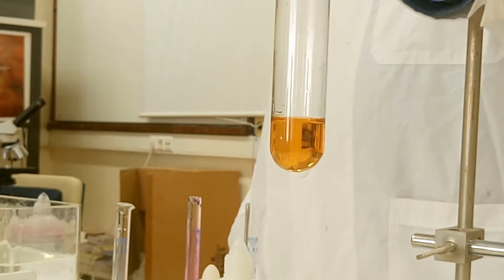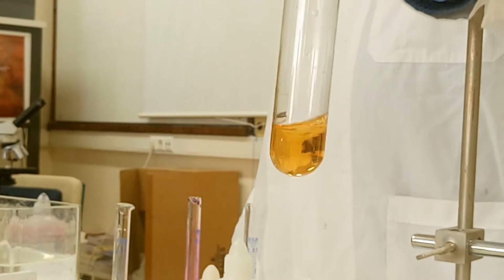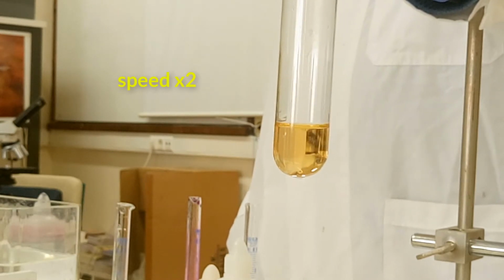As you probably noticed just a minute ago, the reaction kicked off slowly with no apparent carbon dioxide production, but then carbon dioxide bubbles start to appear and became more and more evident.